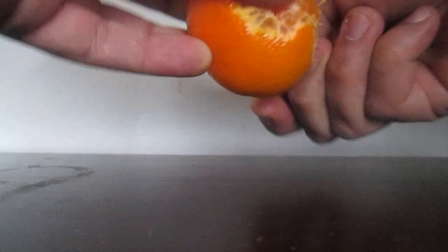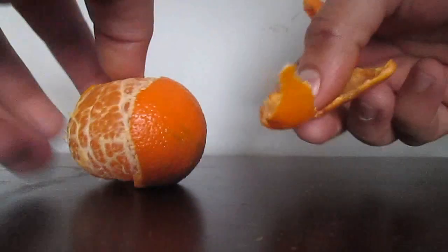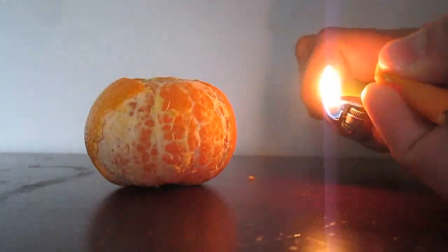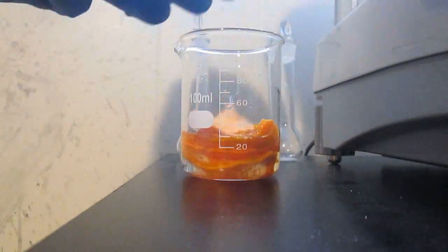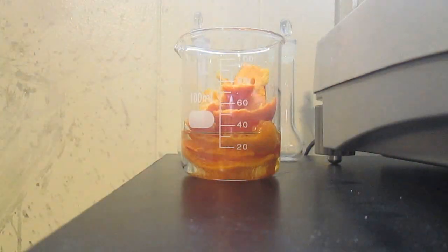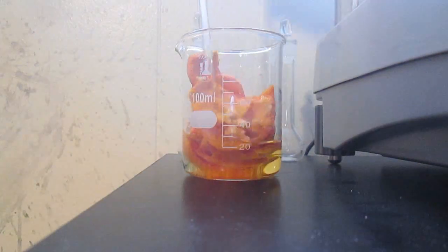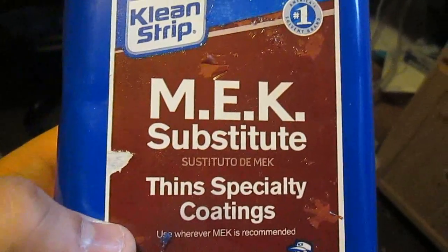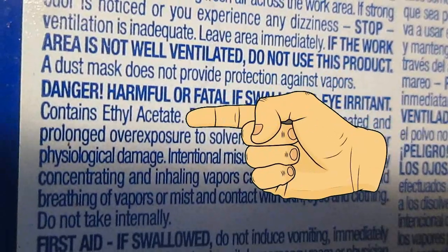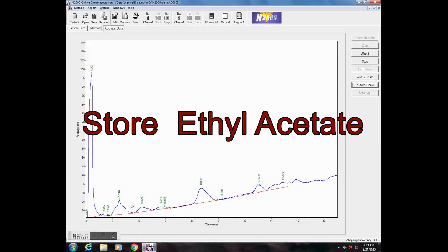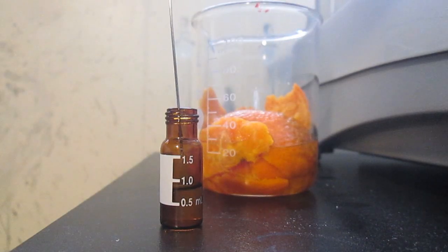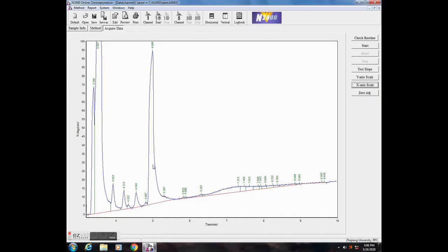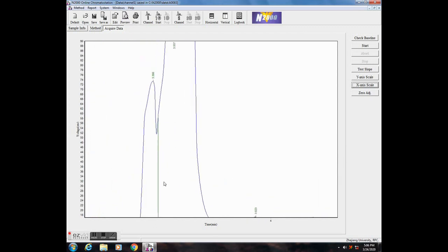Next, I tried to analyze the smelly fluid of a citrus skin and see what makes it flammable. I used dichloromethane to extract as much organic material as possible for the analysis. I suspected a lot of esters, and I'm trying to get a retention time for ethyl acetate from MEK substitute from the store. My first injection revealed a large main peak and several others at low retention time.